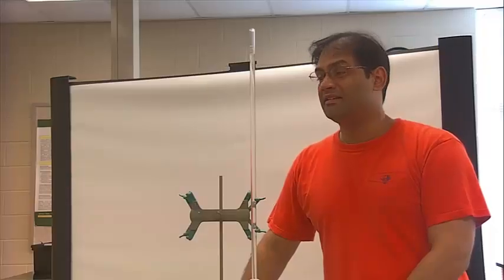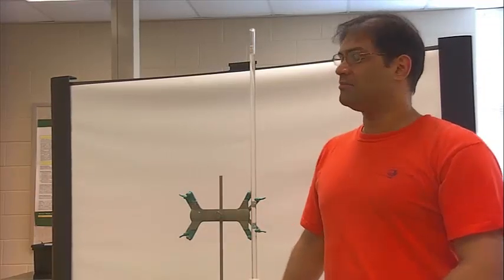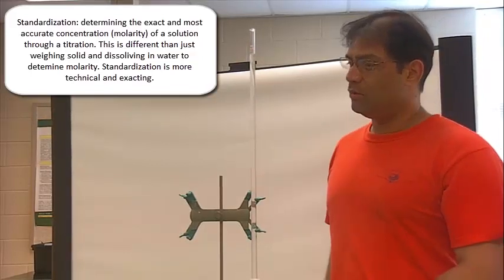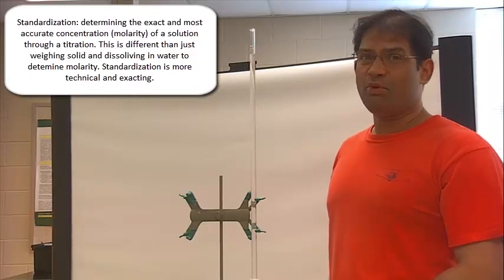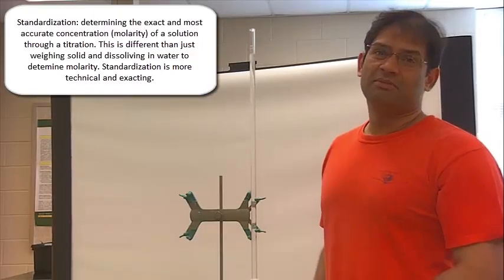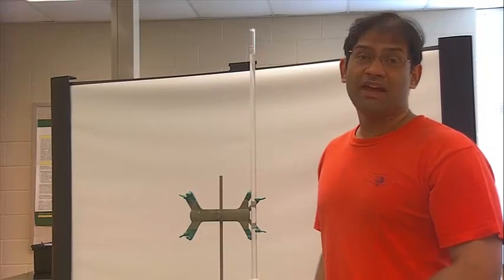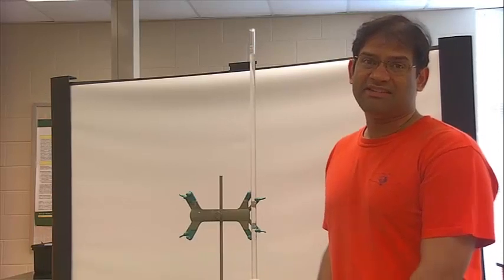Before you begin assessing the solubility of calcium ion and iodate ion in calcium iodate, the procedure asks you to perform a standardization. You'll have your titrant, the substance that fills the burette, with sodium thiosulfate. The approximate concentration given is 0.025 molar, but that may not be the exact concentration. So the purpose here is to perform an exact determination of the concentration of the 0.025 molar sodium thiosulfate. That process is known as standardization.